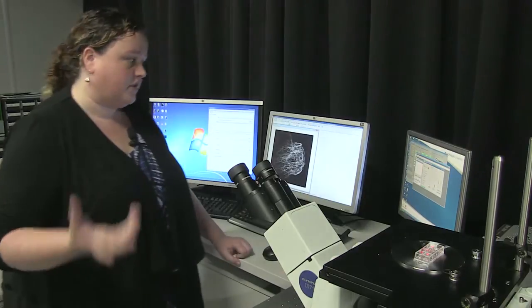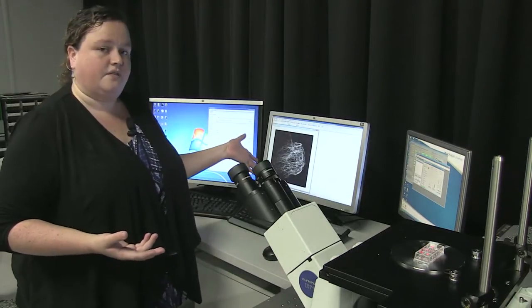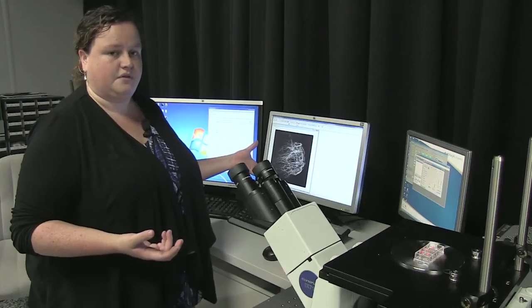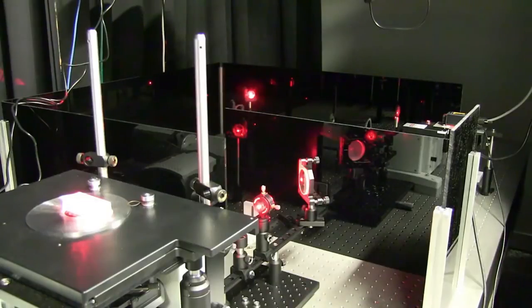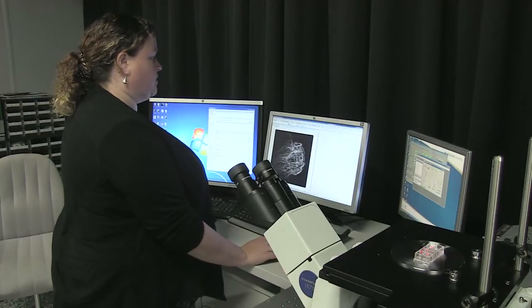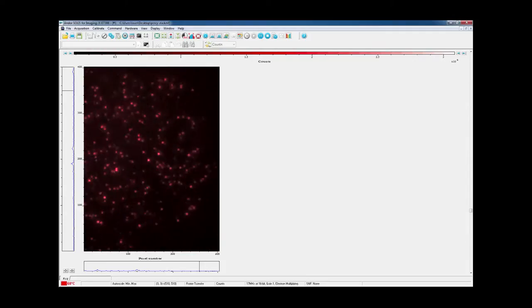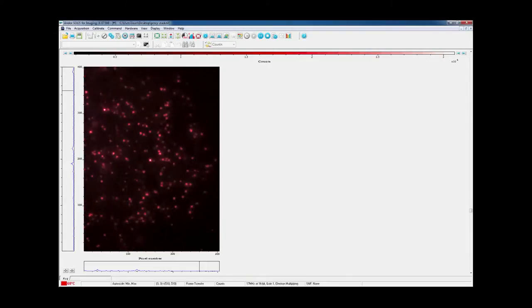You just put it onto the microscope, you have a hunt around until you find something that looks like it's worth imaging so these are very nice microtubules that we found and then all you have to do is turn the laser up and by doing that what you'll start to see after just a few seconds is really nice blinking of your sample.